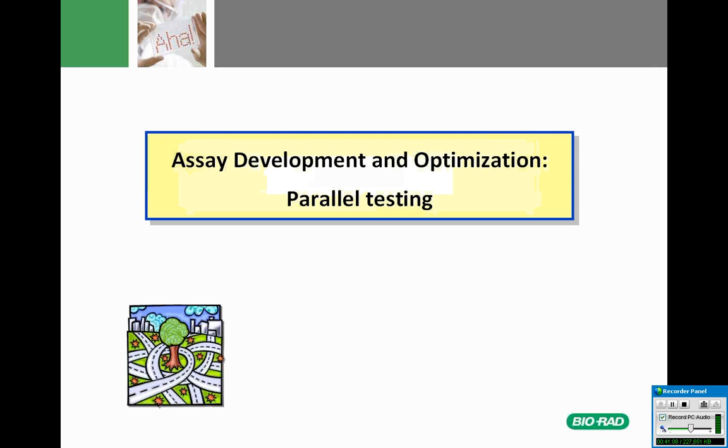So this was the first part, to describe the ProteOn capabilities and just tips and hints on how to perform a basic SPR experiment with all those stages of it. And in the second part, I will describe several applications that were collected with the ProteOn XPR36. The first one is an example of an assay development using the parallel processing of the ProteOn XPR, the 6 channels that run in parallel.